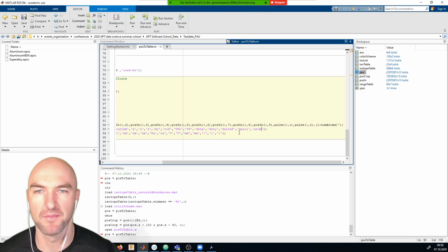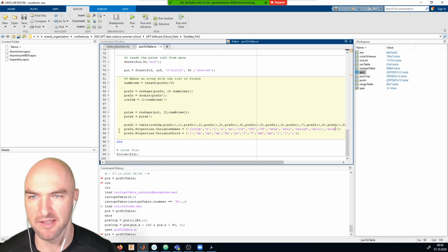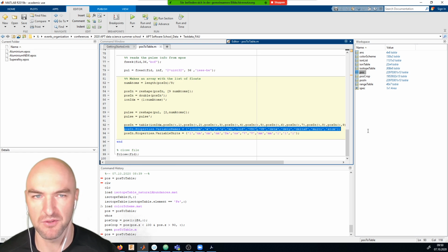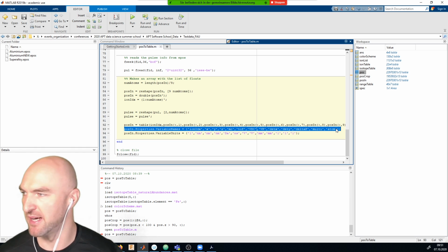Oh, sure. So if you go into the script, it's on this line here, so line 93. Line 93, and at the end it says atom and then pound sign. And I've removed the pound sign, okay? This was the issue here.